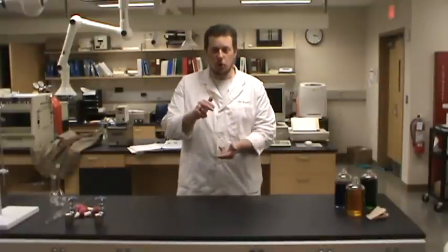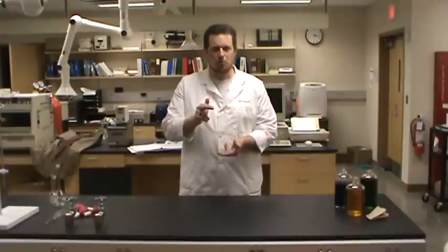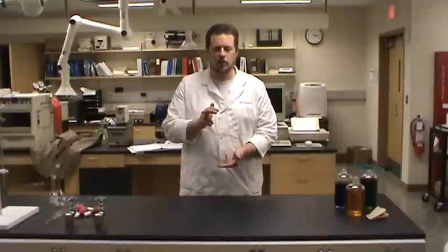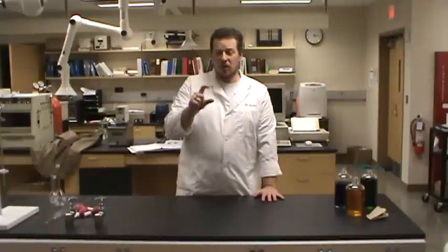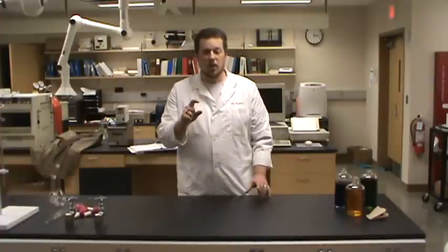If we don't know how much we need but we need to know exactly how much we've used, then a burette is probably a good bet for us. But what if we're doing an experiment where we either need to use a very specific amount of reagent or we need to make a very specific amount of reagent? Those are the times when volumetric glassware comes into play.